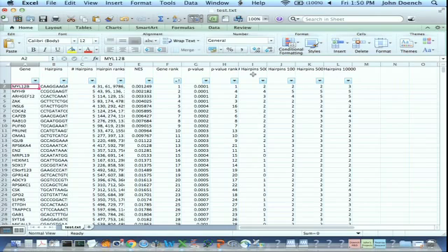The normalized enrichment score is actually used in the KS analysis that John mentioned earlier. It's the amount of enrichment for that gene's hairpins versus the whole set using a certain metric. Well, actually, I don't know how it plays in here.